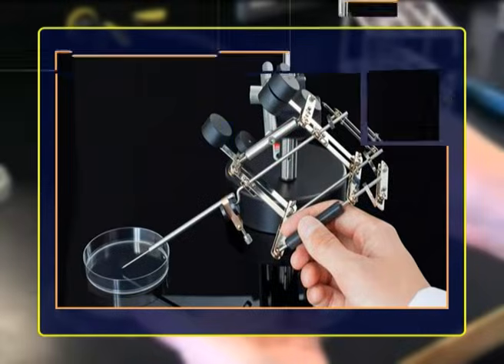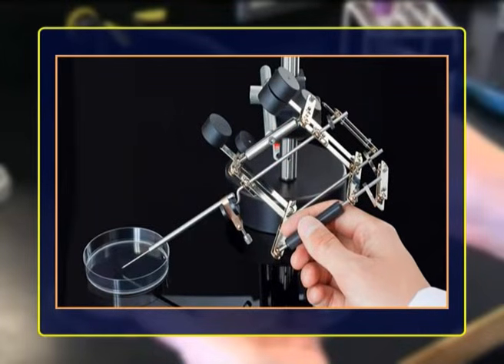A series of hanging drops of a diluted culture are placed on a special sterile cover slip by a micropipette. Now a hanging drop is searched which contains only a single microorganism cell. This cell is drawn into the micropipette by gentle suction and then transferred to a large drop of sterile medium on another sterile cover slip. When the number of cells increases in that drop as a result of multiplication, the drop is transferred to a culture tube having suitable medium. This yields a pure culture of the required microorganism.